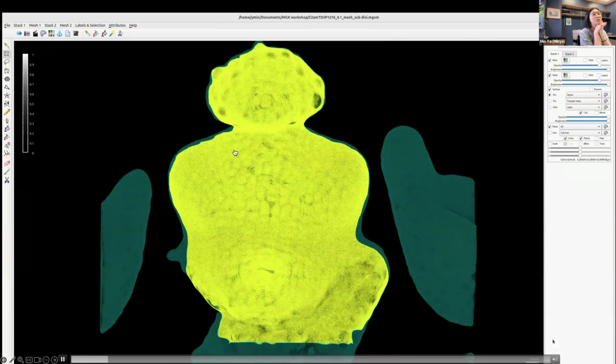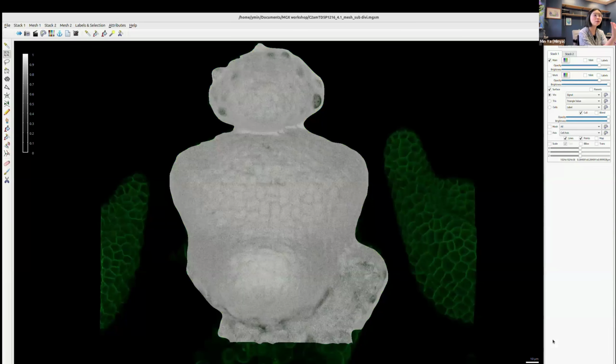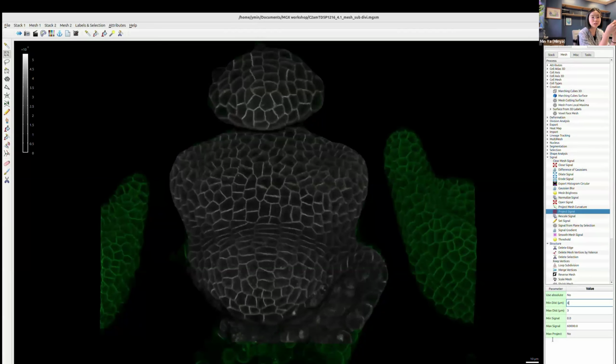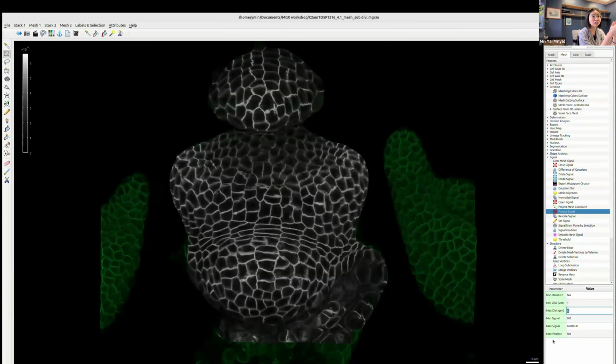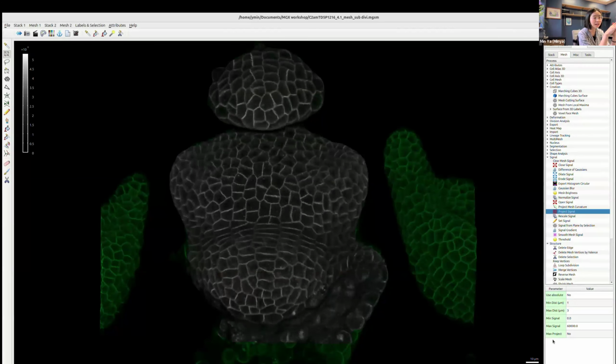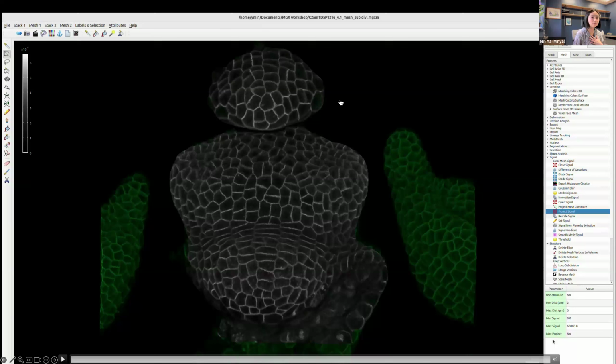Now we can project the signal from our actual Z-stack onto this mesh that we processed, through a process called project signal. This is a process where you have to experiment with different numbers for your particular sample. I'm showing here that different numbers have a very different effect for the projected signal, right? So just now 4 and 6 is too distorted, 1 to 2 is very light. So the general rule of thumb is that I keep it consistent for all my samples across experiment. And after we project the signal, now it's the fun part, which is, where's my mouse?